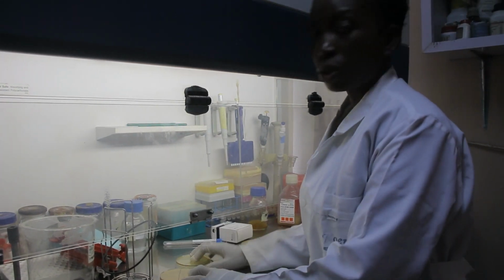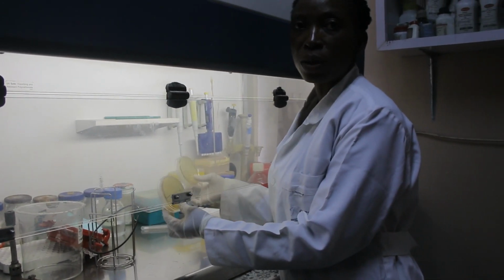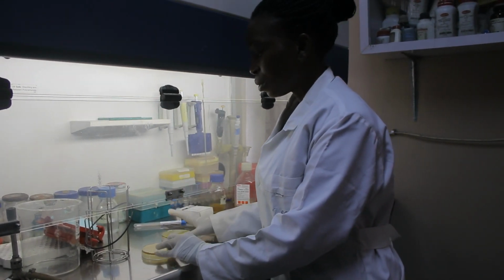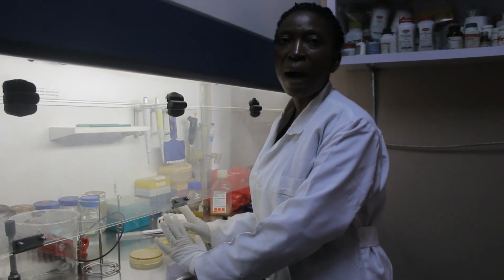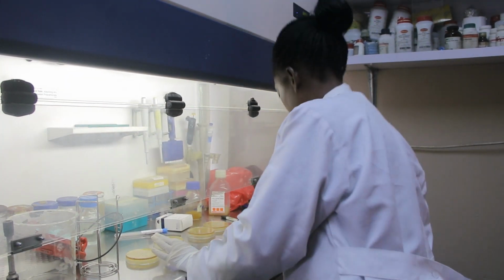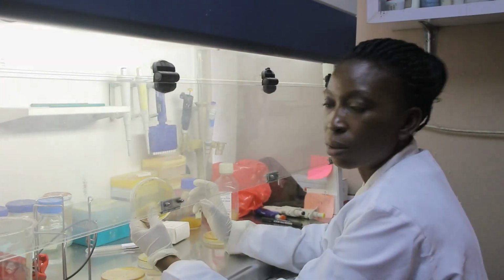So from this culture, after confirmation with catalase, urease, and oxidase, the distinct colonies will be picked. Colony 1, 2, 3, and pooled. The distinct colonies will be taken onto fresh serum plates.